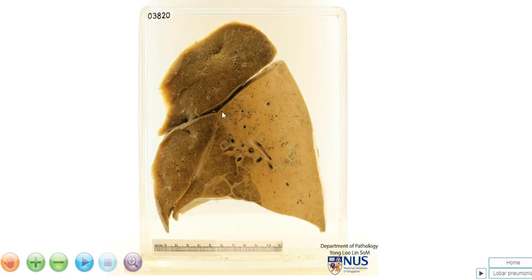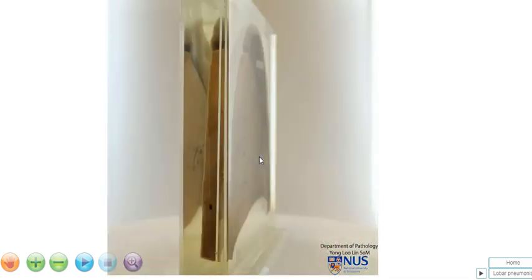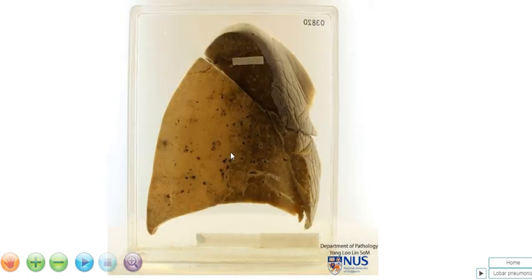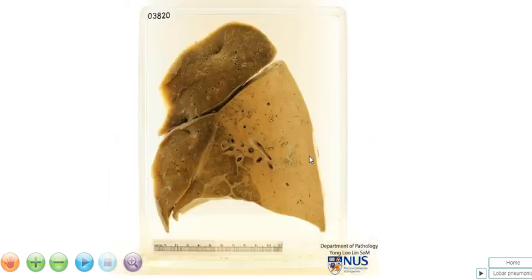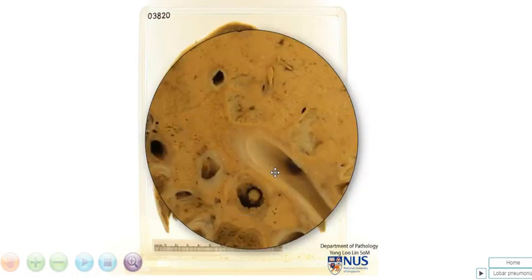Hello, this is the specimen of the right lung, showing the upper lobe, the middle lobe, and the lower lobe. You can see that the lower lobe is obviously abnormal, and let's zoom closer in using the magnifier.